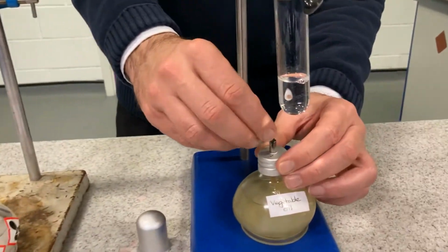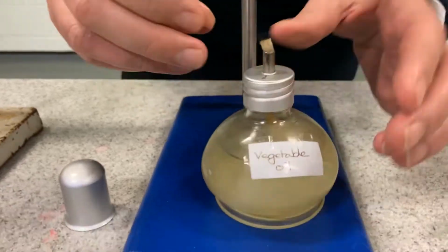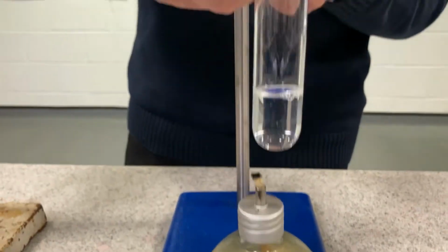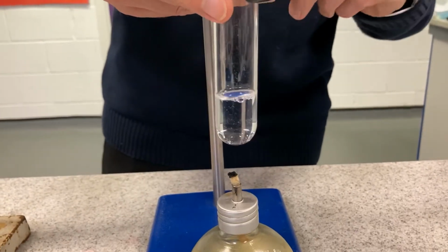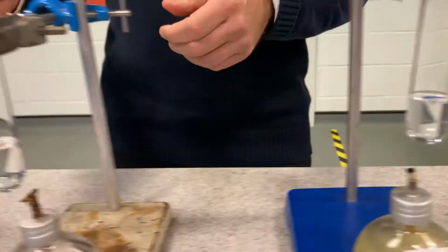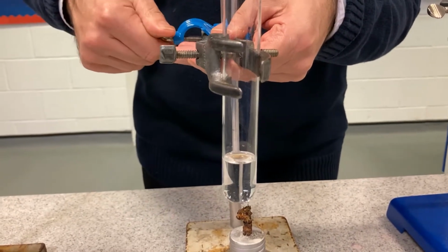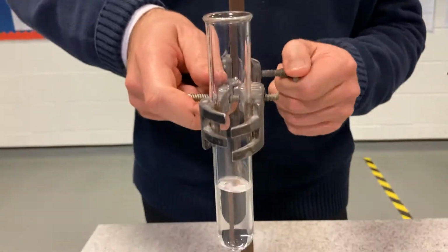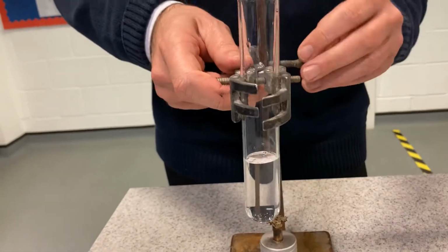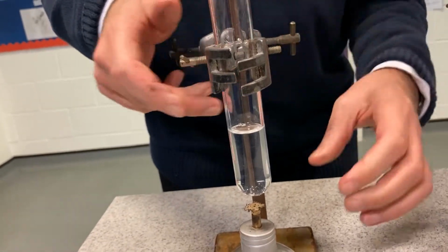Now, again, I've got to make this a fair test. So I need a bit of wick poking out of all of them. I need a little bit, roughly the same size. And I've got to make this test tube the same distance away from it. Just get it adjusted. Oh, this is way out. Can't have that. Bring it right down. Fair test. All the variables just the same.